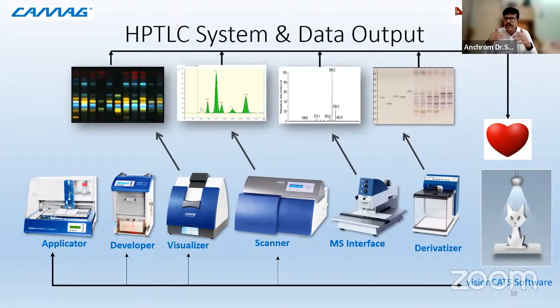Whereas in the manual process, we do it more manually. We take the plate, we dip it, and we ensure that we dip it in the proper way, because a slight tilt would result in a tilted solvent front. My molecules, instead of being straight, will become tilted, and because of which I will not get my results properly. So I have to be careful.